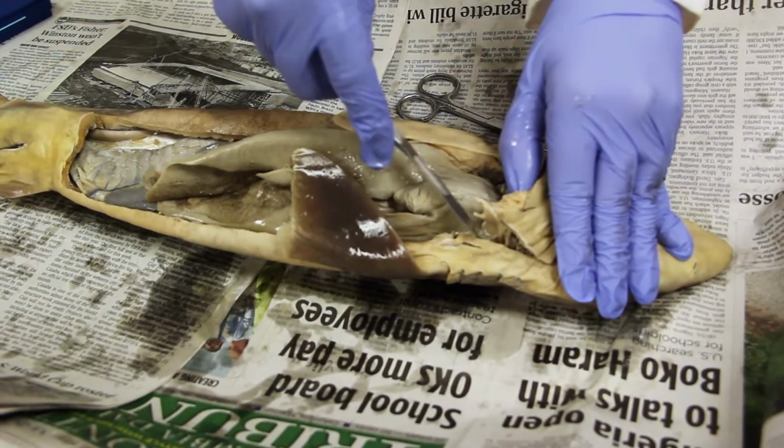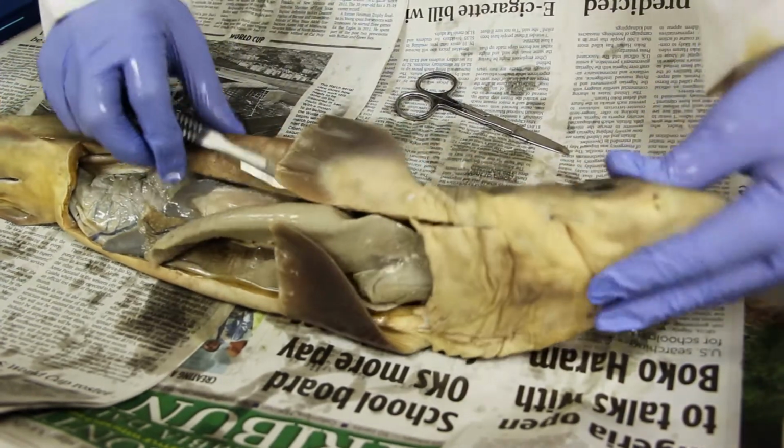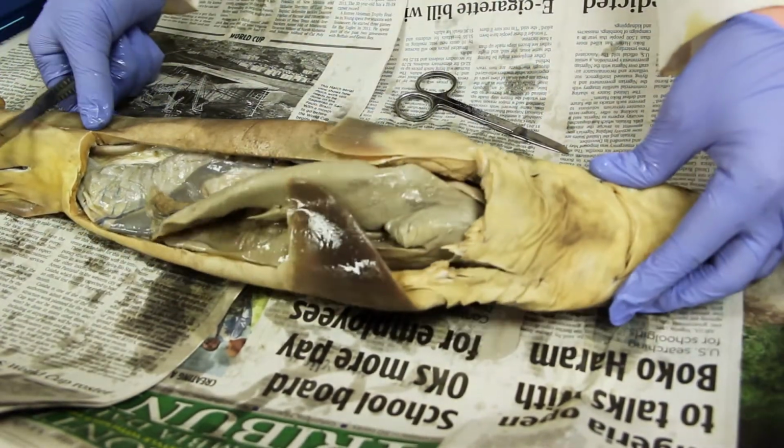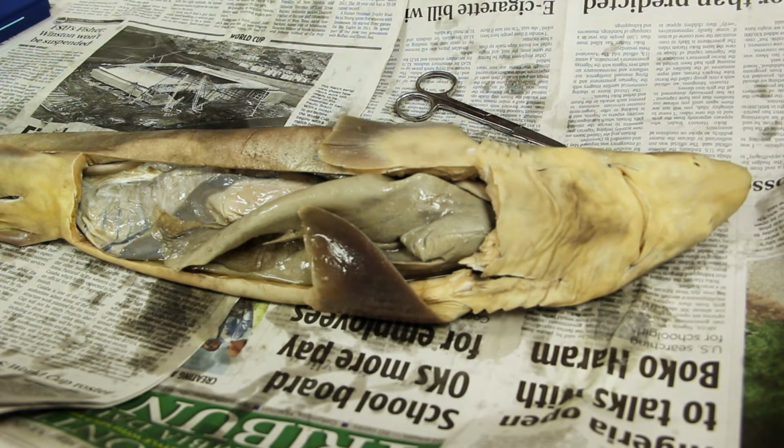If you wanted to see all that, all you have to do is cut more into here, and you could flip it over and cut the top of his brain. But we're not going to do that today, but you can try to convince your teacher to let you do that, because it's actually pretty interesting up there, and it's similar to the human's brain and has all the same kind of nervous system aspects. The next in the brain is the cerebrum, and that's the 2 hemispheres between the olfactory lobes and the sacs.